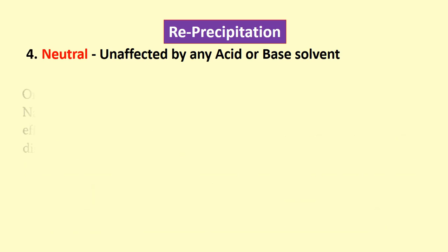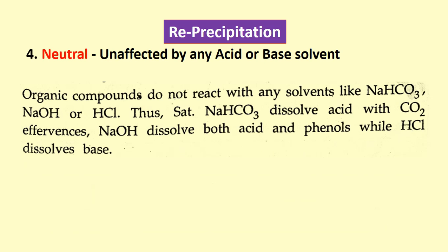Next, neutral. A neutral compound is an organic compound that does not react with any solvent like bicarbonate, sodium hydroxide or hydrochloric acid. The saturated bicarbonate dissolves acids with CO2 effervescence.